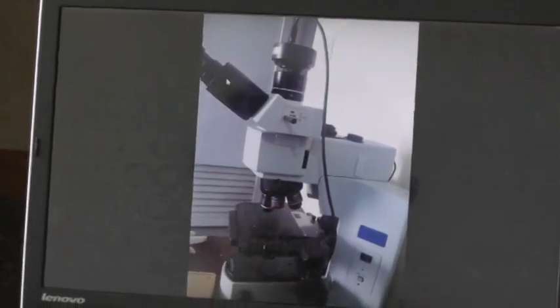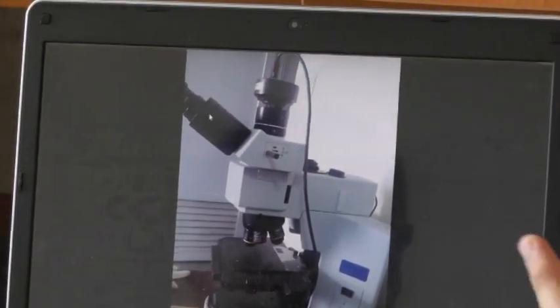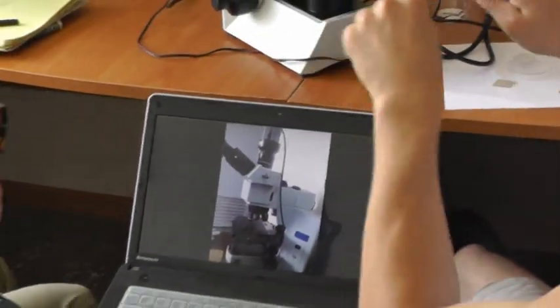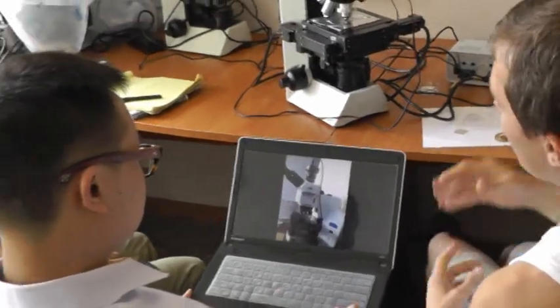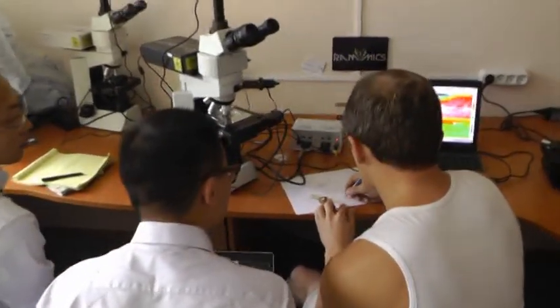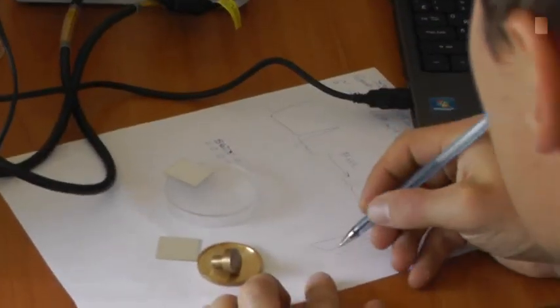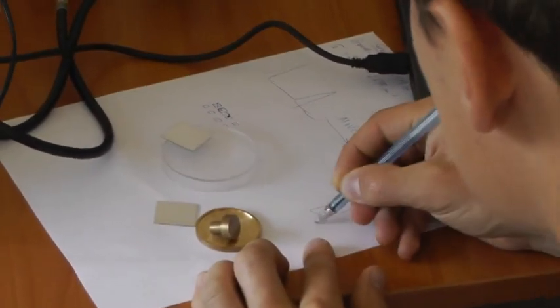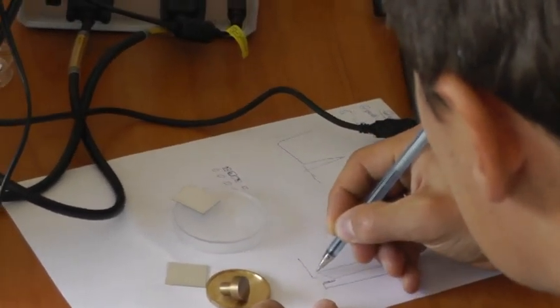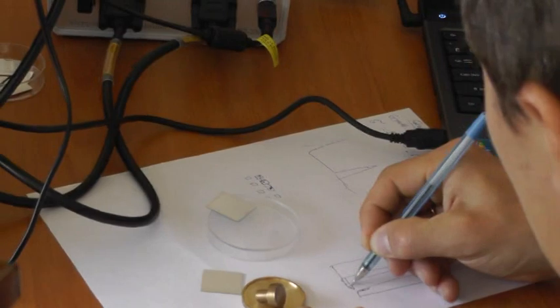As far as I know, in Olympus they have all parts of microscopes separately and connect them via a triangular connector. Do you know how it looks? It looks like an assembly flange like this, and all parts are connected using this assembly.